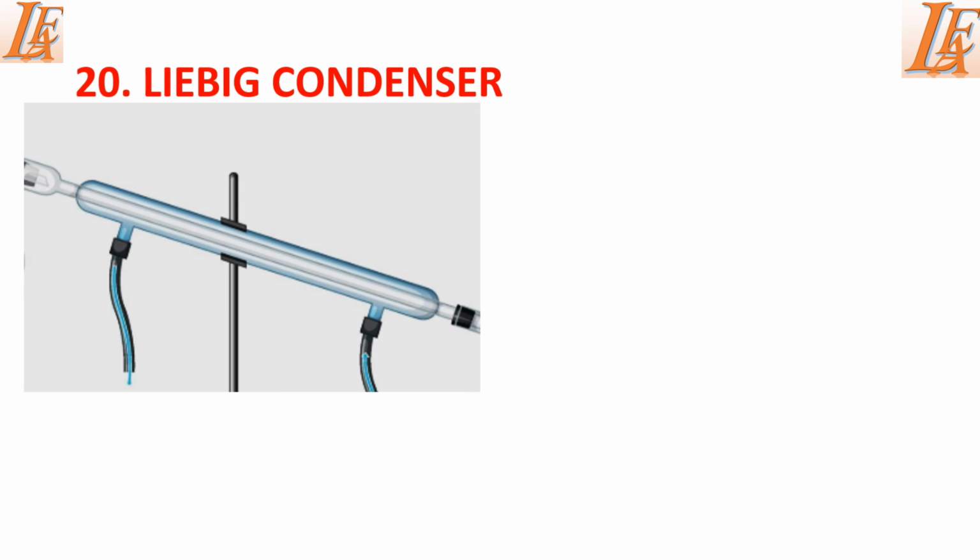Another important apparatus that we have is a Liebig condenser, and a Liebig condenser is a long glass tube with an inner tube for vapor and also an outer jacket for circulating cold water. And this one is mainly used to distribute cold water to condense vapor back into liquid state.